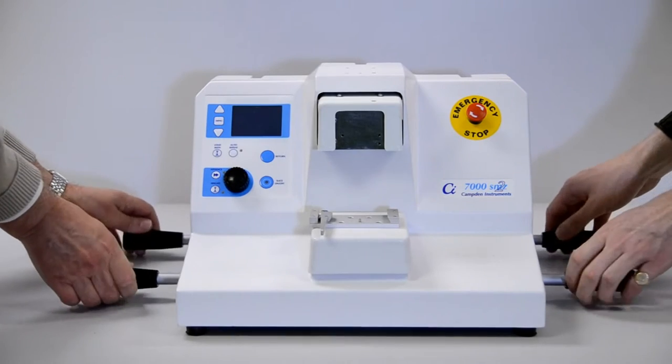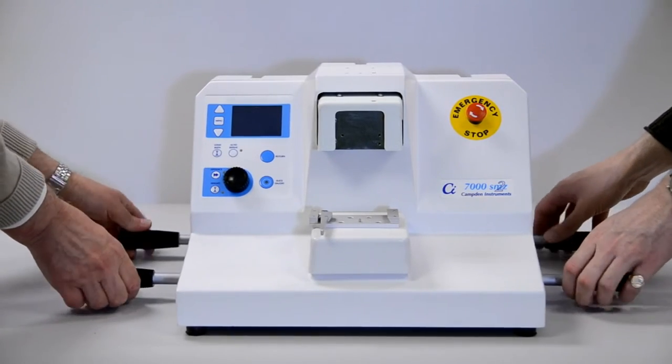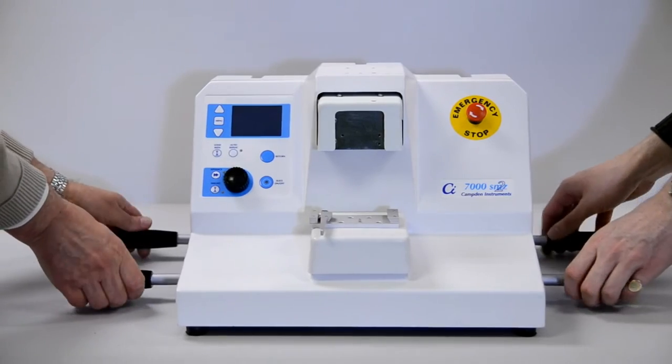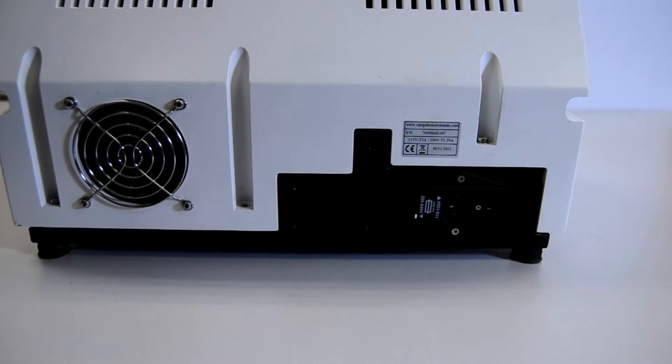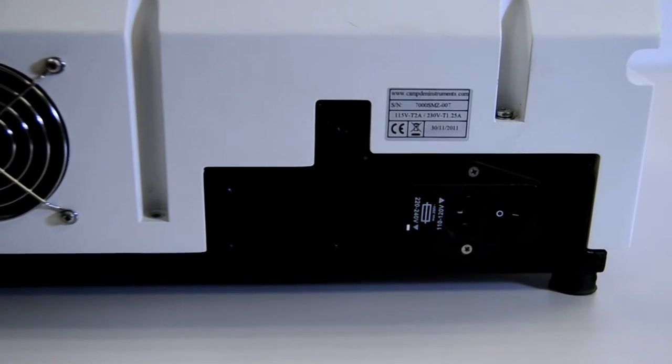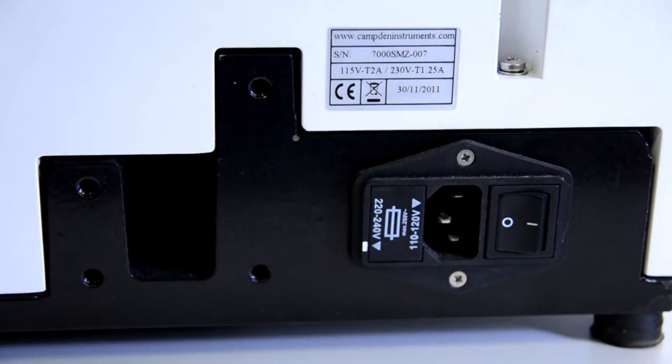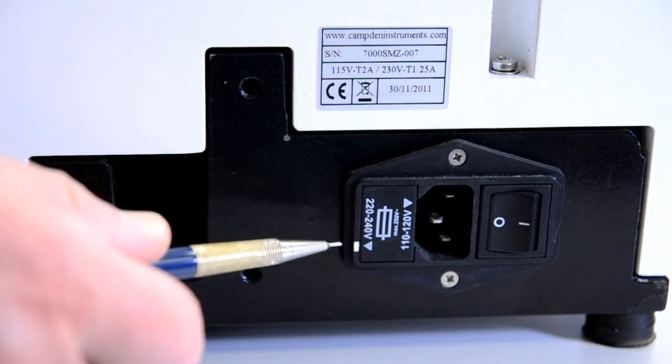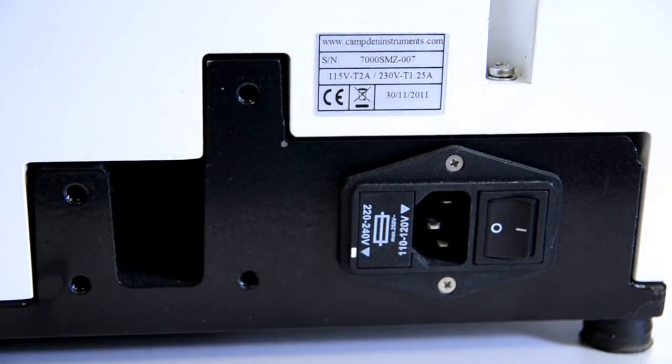The wooden shipping box in which the instrument was delivered also contains the specimen bath assembly, tool case, electrical lead, and any optional extras that you may have ordered. Before connecting the instrument to the electrical supply, check that the supply voltage setting on the rear panel is correct for your particular country. The operator's manual shows how to check or change the setting in greater detail.